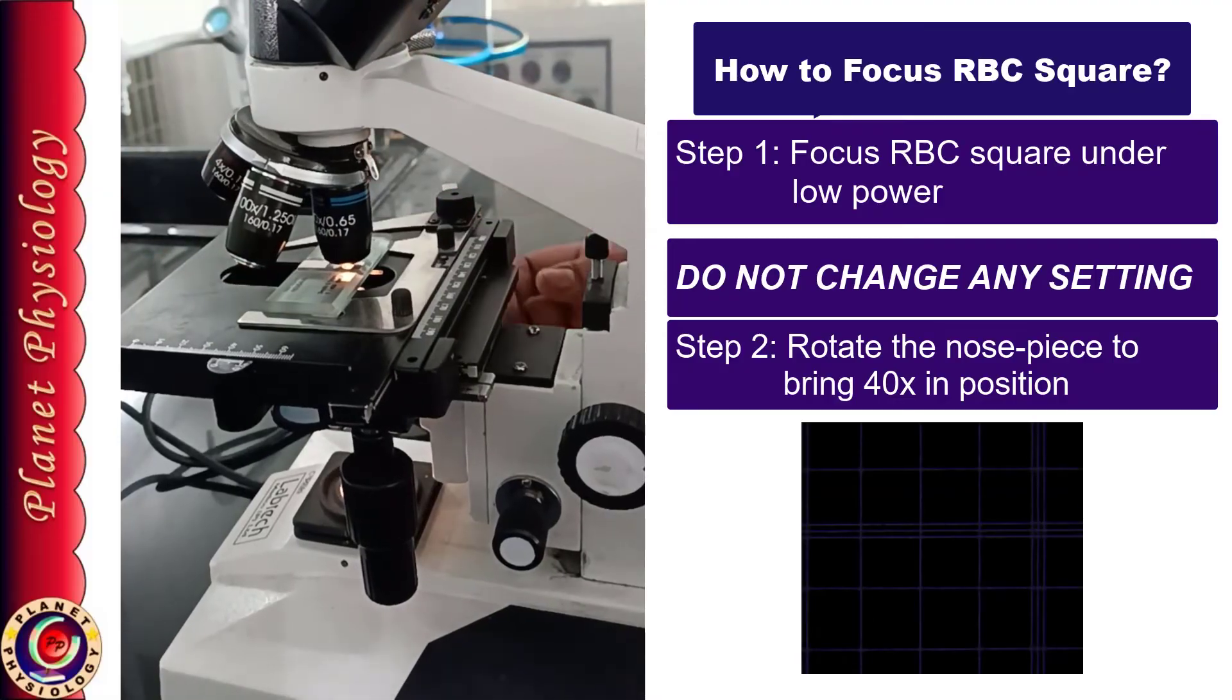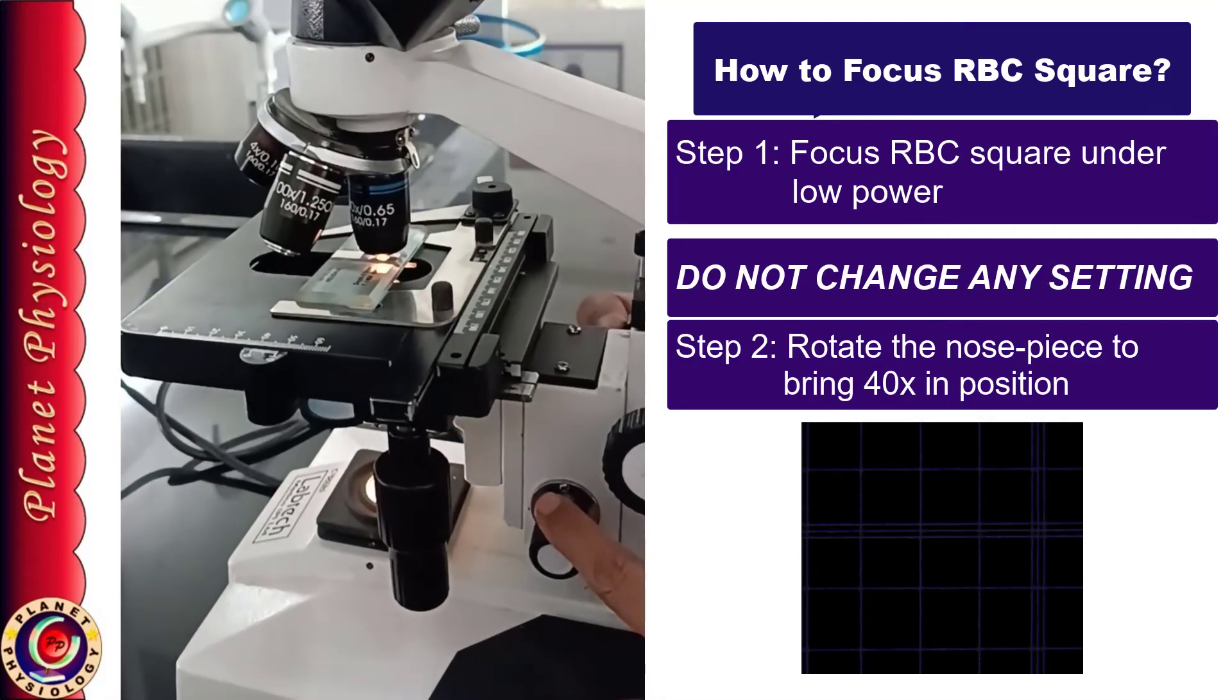So rotate the nose piece slowly while looking from sides and if your microscope has original objectives then high power objective will not touch your coverslip on the chamber.